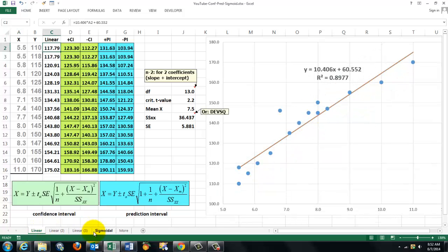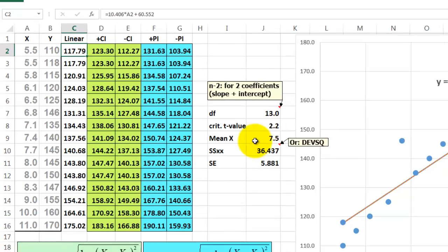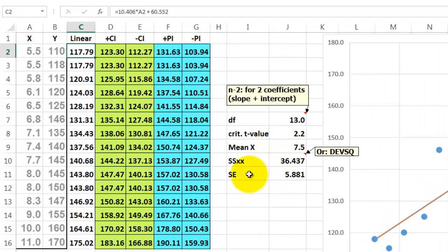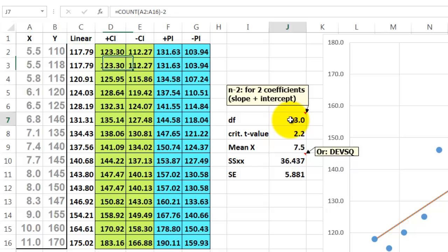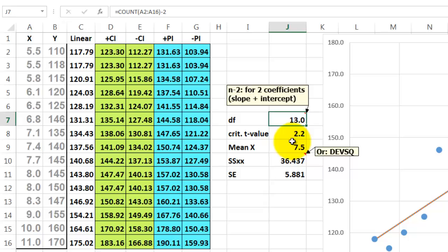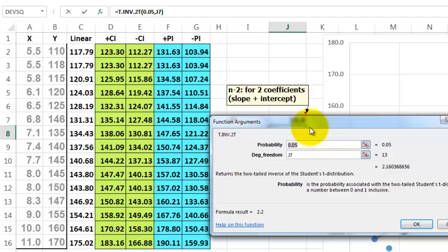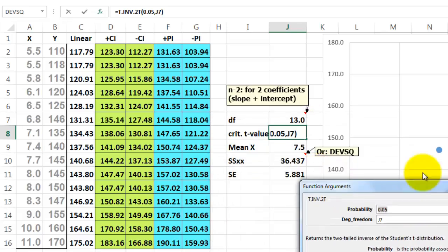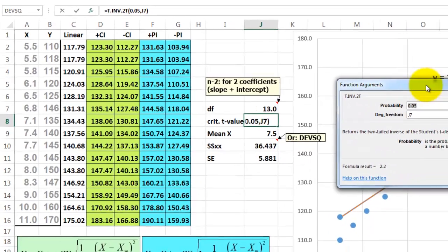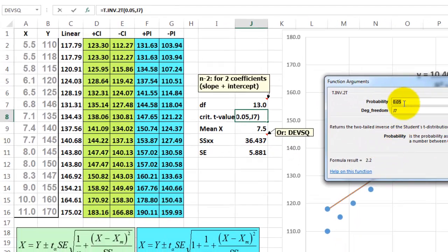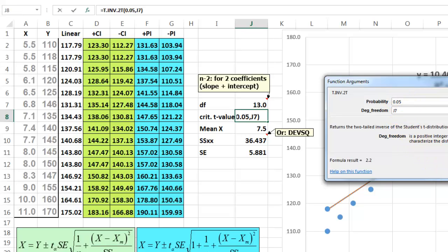So what do we need to do? In order to get all these variables, we need to do some calculations. First of all, we have to know what the degrees of freedom are. We add a number of cases minus 2 because we have two coefficients, the slope and the intercept. Then we calculate the critical t-value with the t-inverse function at a 5% confidence level, the degrees of freedom, j7.